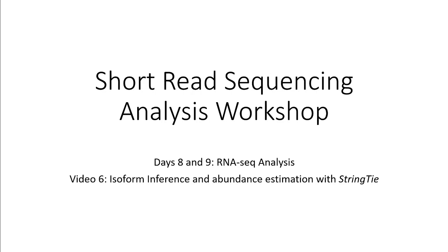This video is for days 8 and 9 of the short read sequencing analysis workshop. This is video 6, Isoform inference and abundance estimation with Stringtie.